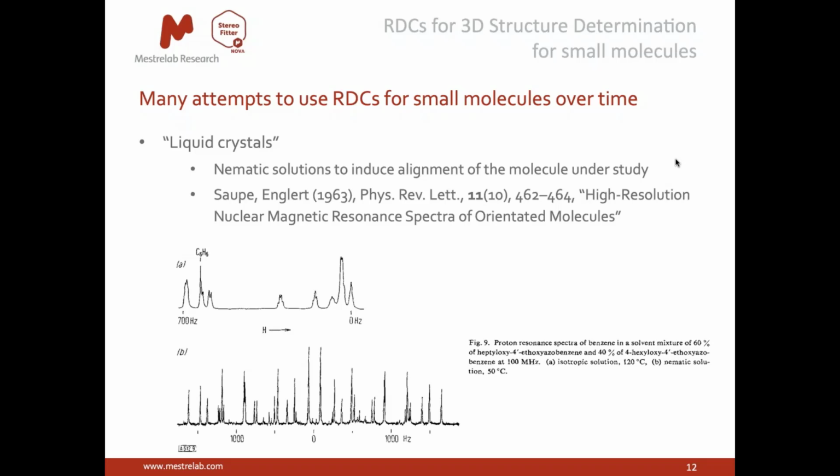The lines are sharp, but as you can see, they are spread out over thousands of hertz. So it soon became apparent that any small molecule with a non-symmetrical structure of any interest was going to be intractable to analyze.